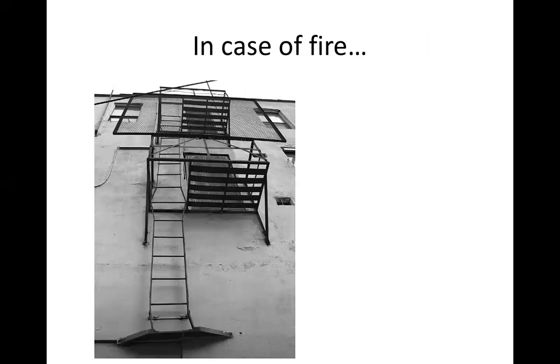Next, of course, in case of fire, and this rule does not just apply when it comes to science classes, it applies to all kinds of situations. In case of fire, you have to know the fire exit. So you have to know where to go. You do not panic.